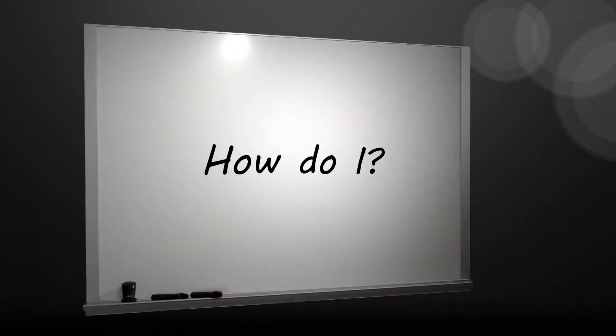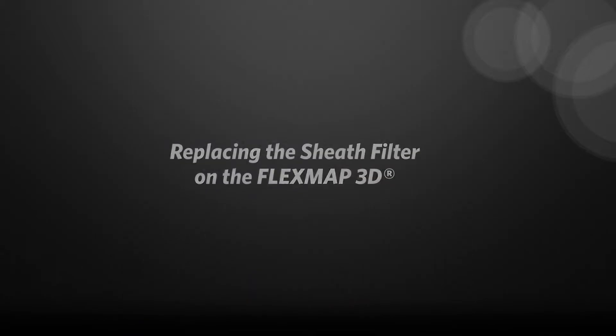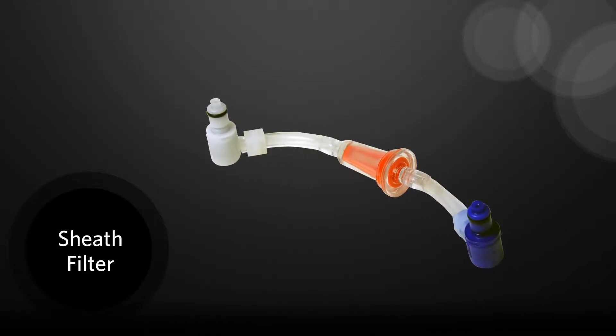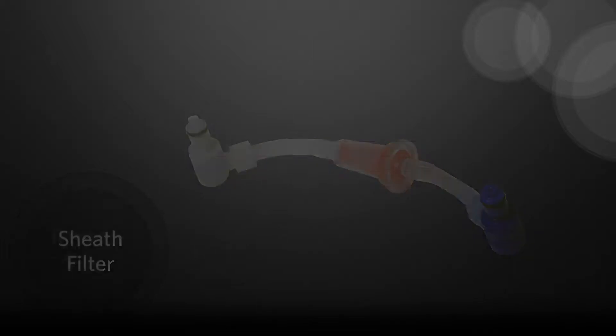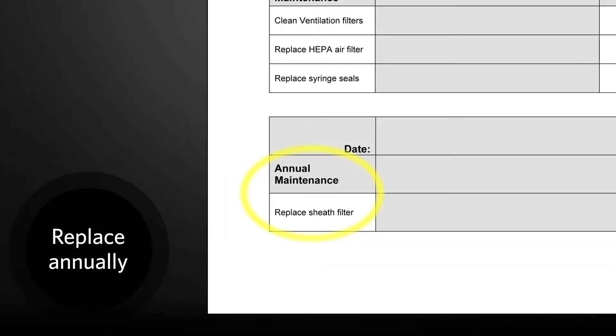How do I replace the sheath filter on the FlexMap 3D? Let's take a look at the procedure for removing and replacing the sheath filter on the FlexMap 3D. This routine is part of the annual maintenance schedule.